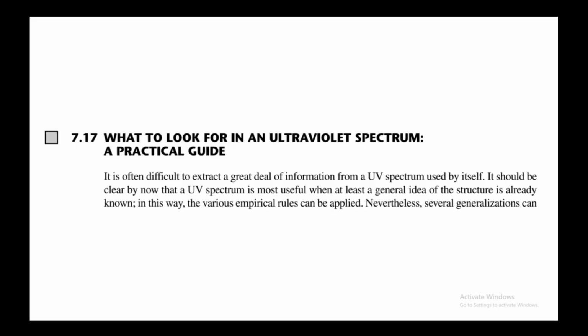Today in this video I'll be talking about how we can get information from a UV visible spectrum, or how we can interpret UV visible spectra, or what information we can obtain from the spectrum of a typical ultraviolet spectrum. Okay.